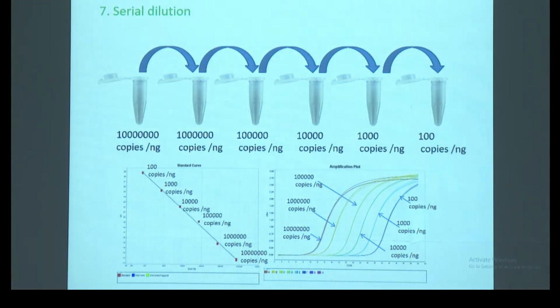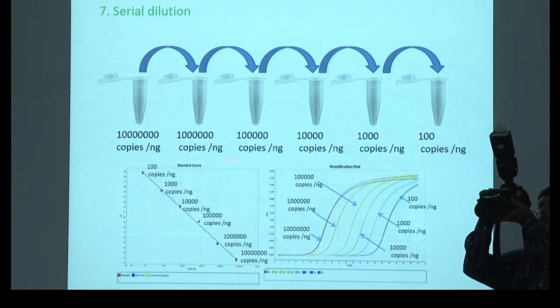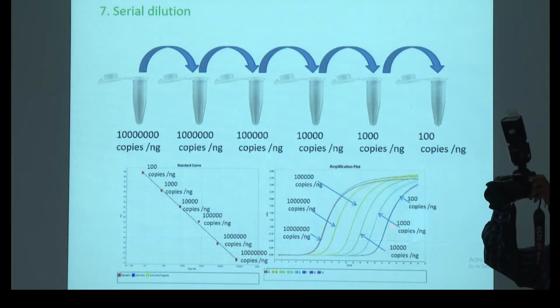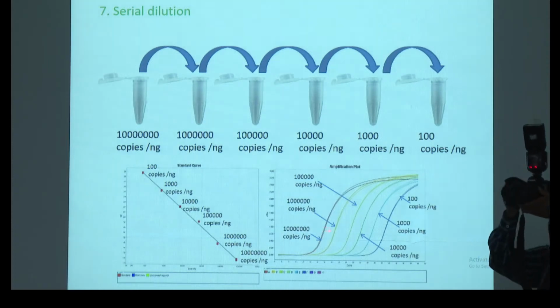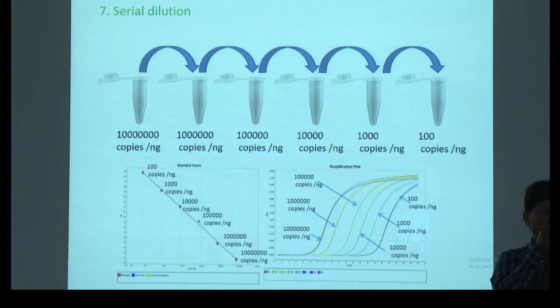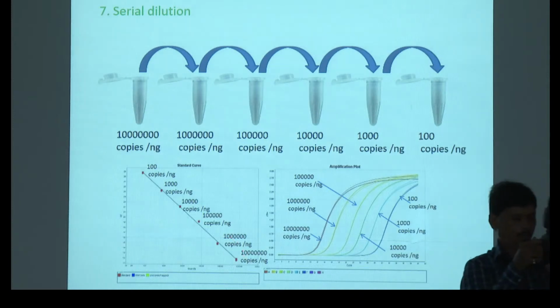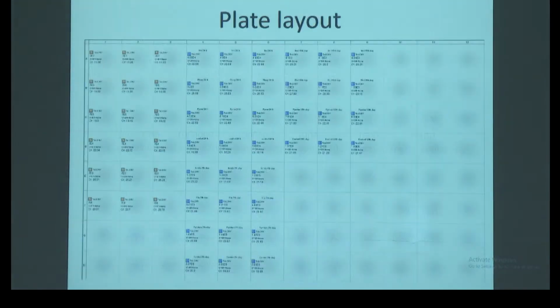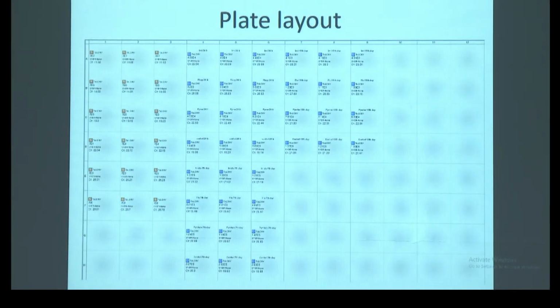Clear है? So when you know these quantities and you run in a PCR, it will give a CT value, है ना? You can see it clearly. अगर later CT है इसका मतलब DNA quantity कम है, early CT इसका मतलब quantity ज़्यादा है, और वो you have to get this equal spacing because you diluted it properly, right? 10-fold serial dilution है तो 10-fold serial dilution का space मिलना चाहिए इस amplification में, है ना? Then you get this standard curve. अभी तक क्लियर है? So now you have the standard curve.